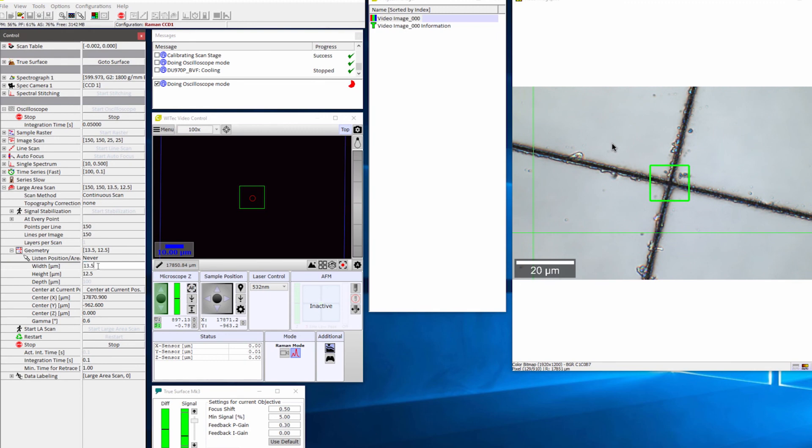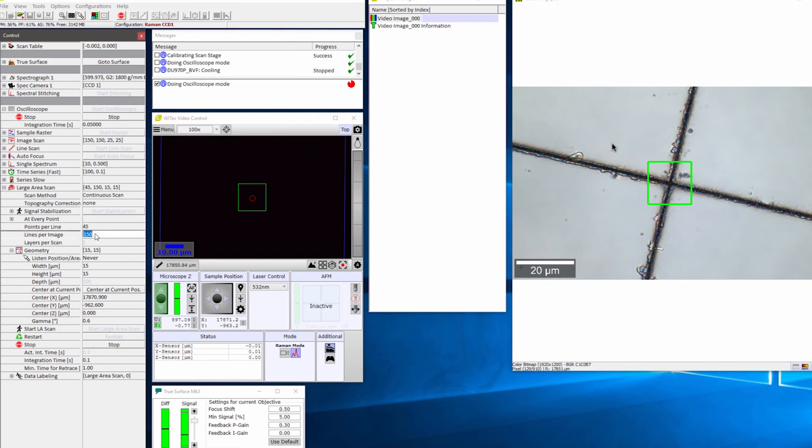In the geometry menu, you can adjust the height and width of the area you want to image. In the At Every Point menu, type in the number of points per line and lines per image you would like to use. Type in the integration time.